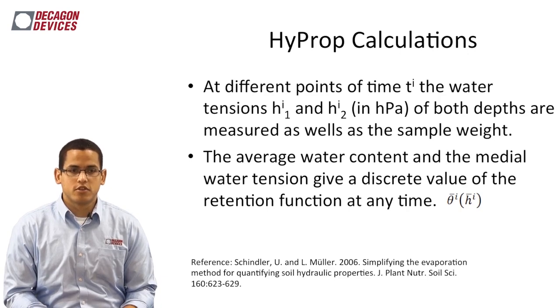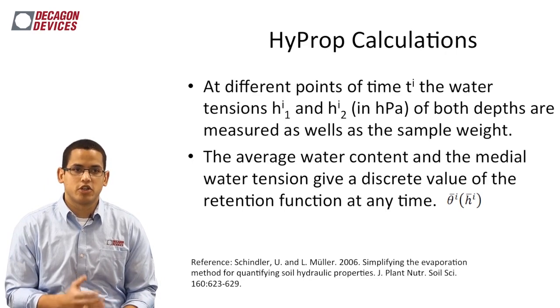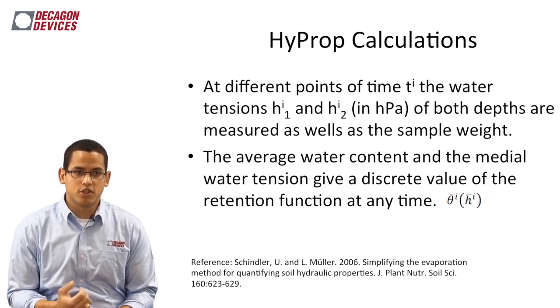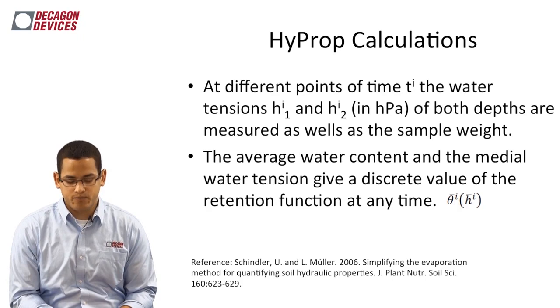And it's a really amazing thing to be able to do, because we're able to generate a lot of points across the moisture characteristic curve over time, very simply with little work once the apparatus is set up.